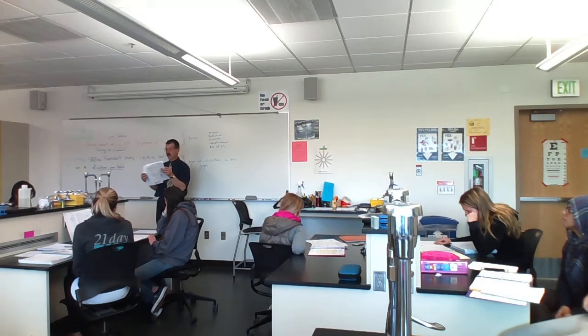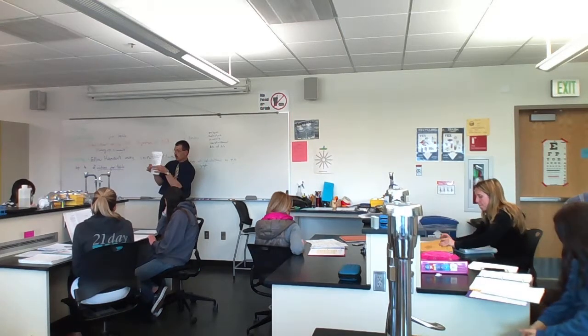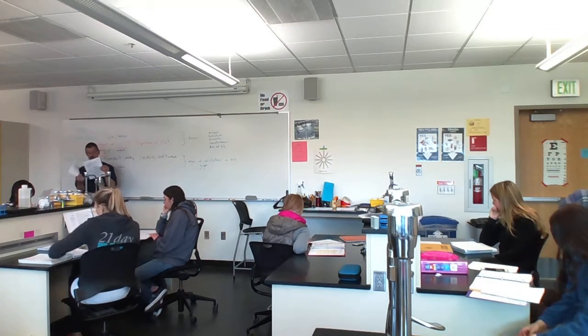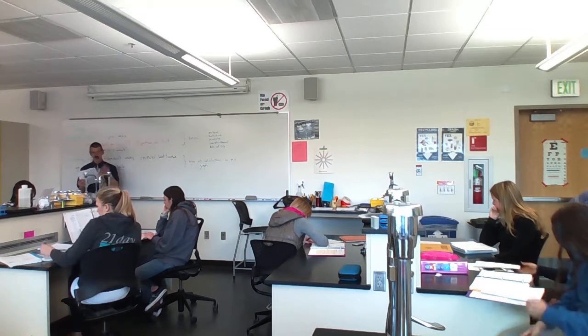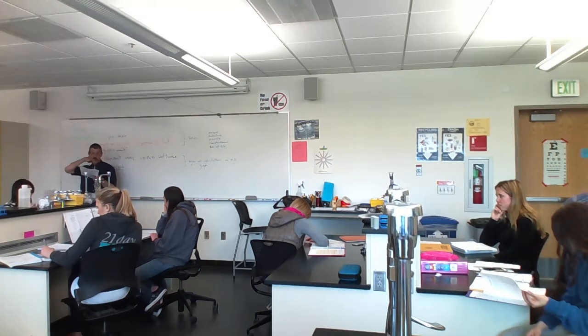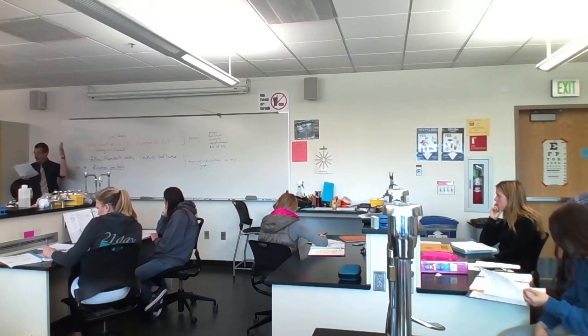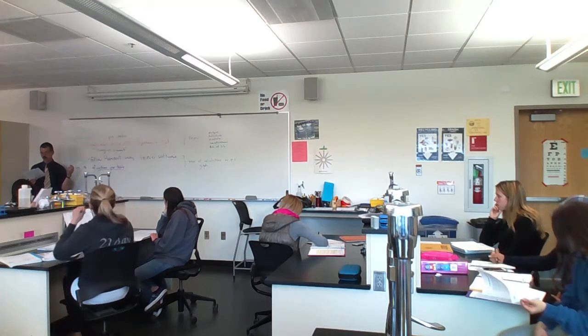And so for next week, for your lab quiz on this lab, you would have to be able to interpret a graph like the one on the first page, like we did in lecture. Could you label the graph? Could you calculate the volumes, like on the table on the third page? Could you calculate good, bad? It'll go up, it'll go down. We did that in the case study in lecture. So your quiz on this lab will be mostly, here's a graph, give me all the numbers and all the calculations based upon this parameter.